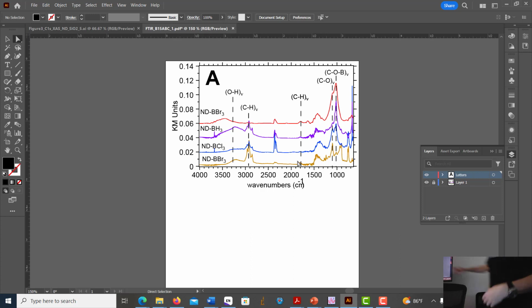In Stephen's case, he can put a figure inside of a figure, but then also highlight a section of it in red. And any of that highlighting that he does in red or purple, whatever it happens to be, would be given a layer as well. So that when he wants to manipulate it, it's only going to happen there. The action is only happening where you want it to.